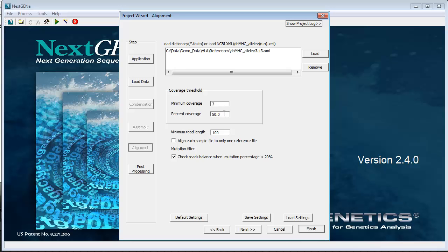Percent coverage is the minimum percent of the gene that must be covered for allele calls to be made for the gene. This should be set based on which regions of the gene were targeted. For example, selected exons only or the full gene.